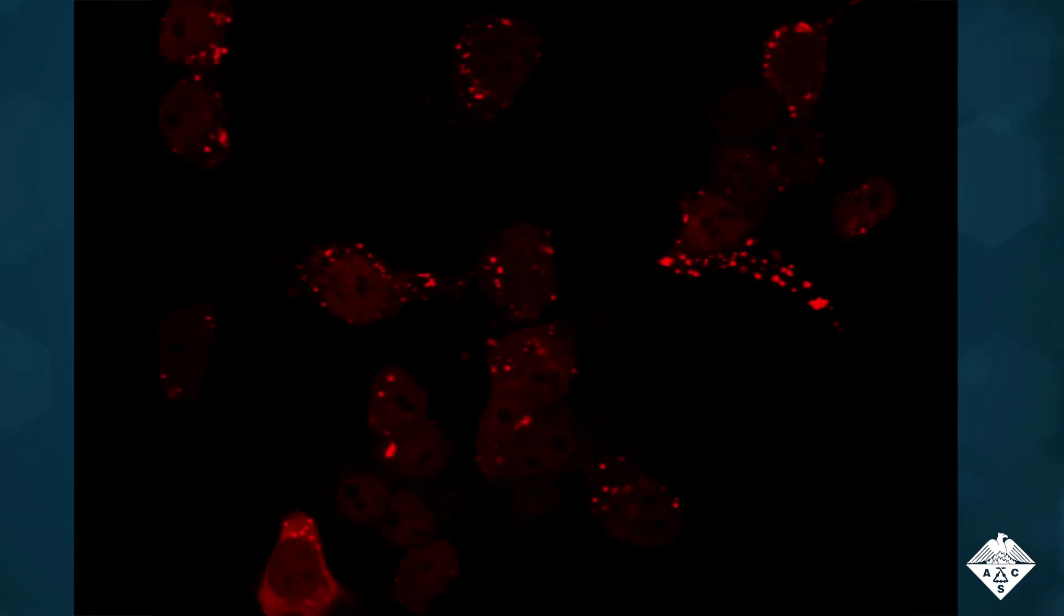And by tweaking the system and using a different dye, the researchers could detect when a small molecule disrupted the interaction between two proteins. Here, they observed the disappearance of intense red fluorescent spots.